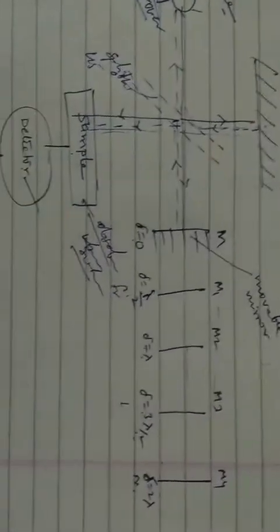This is the overall flow diagram of Fourier transform spectroscopy.